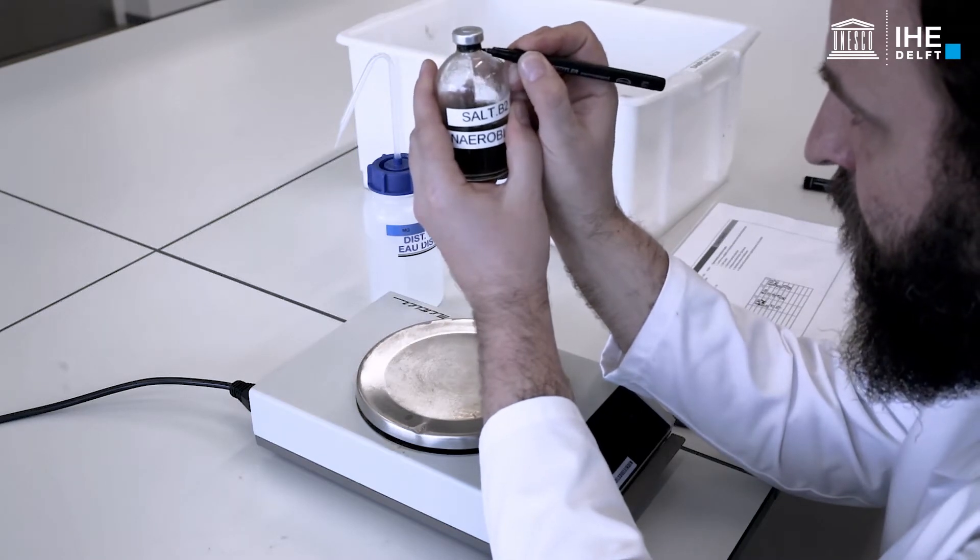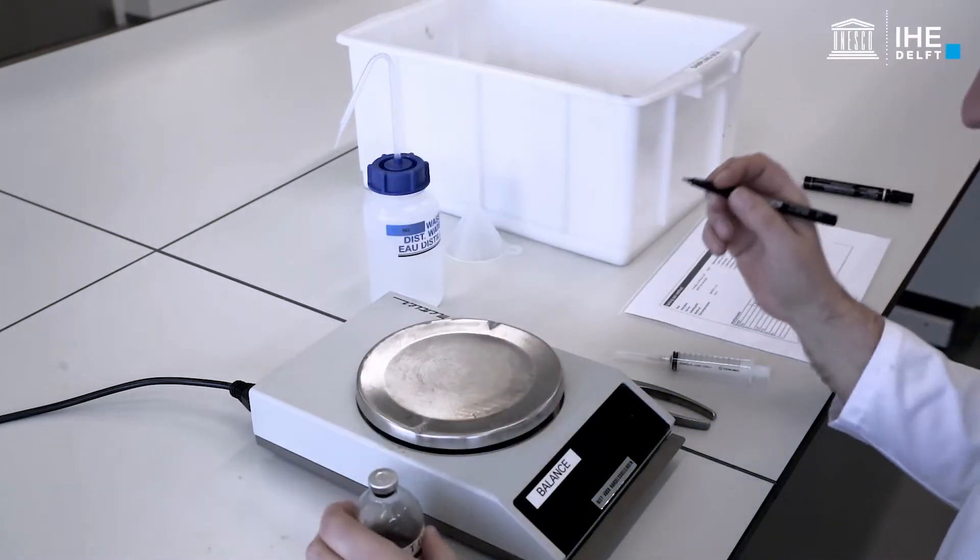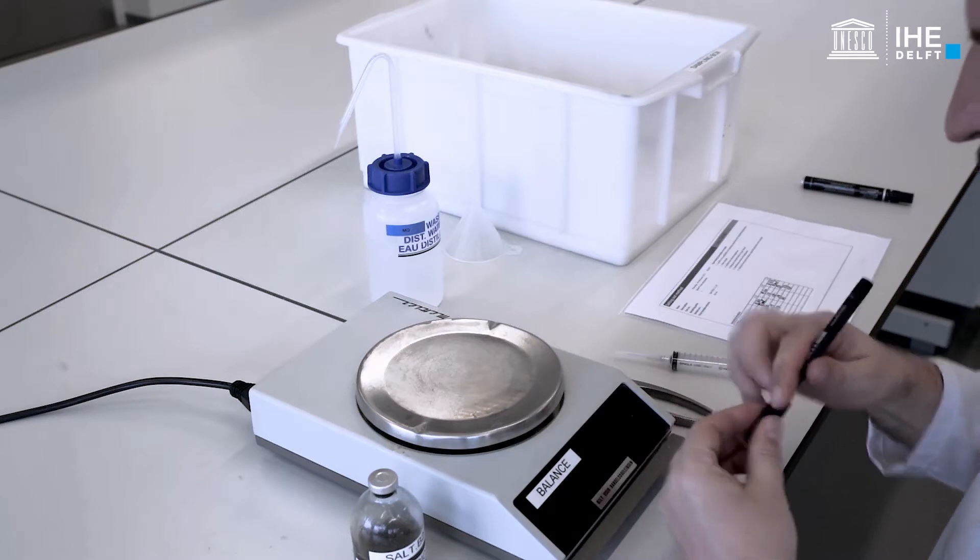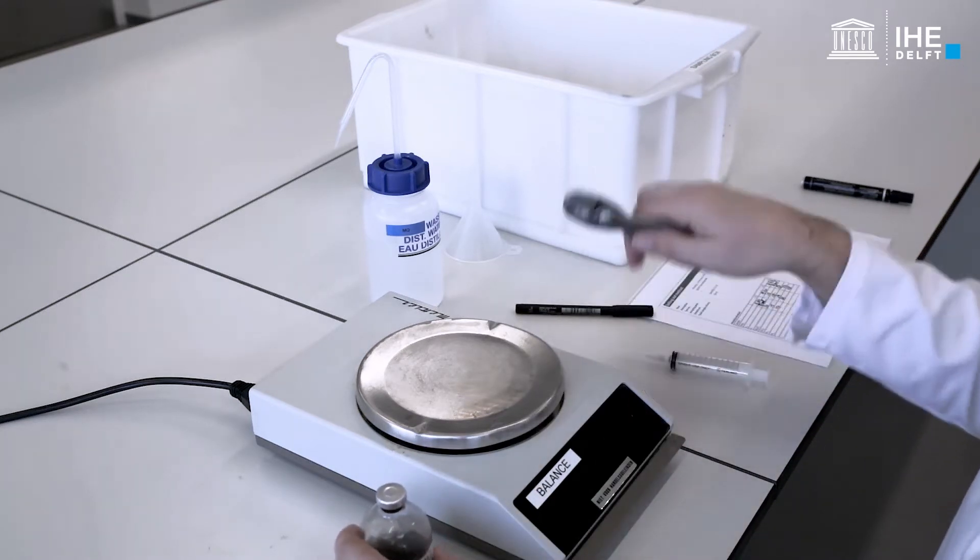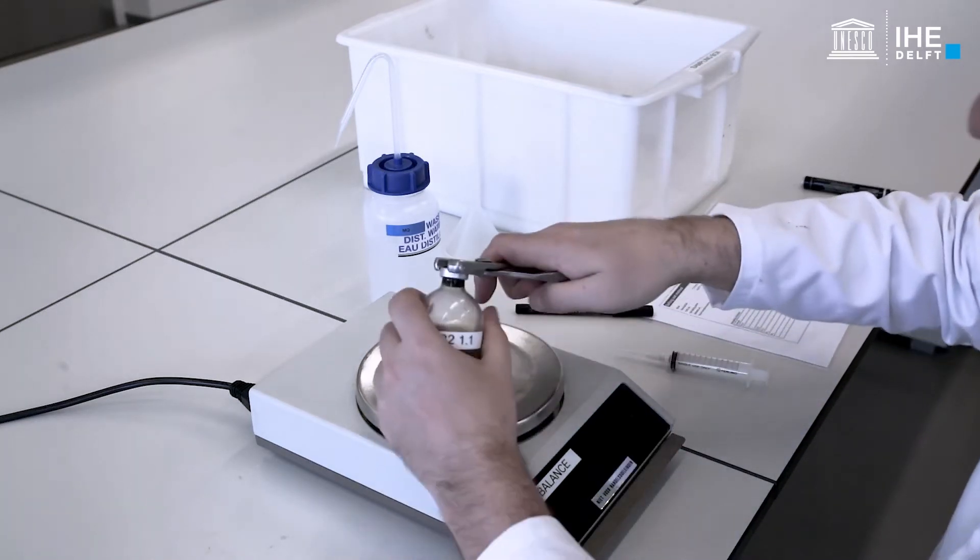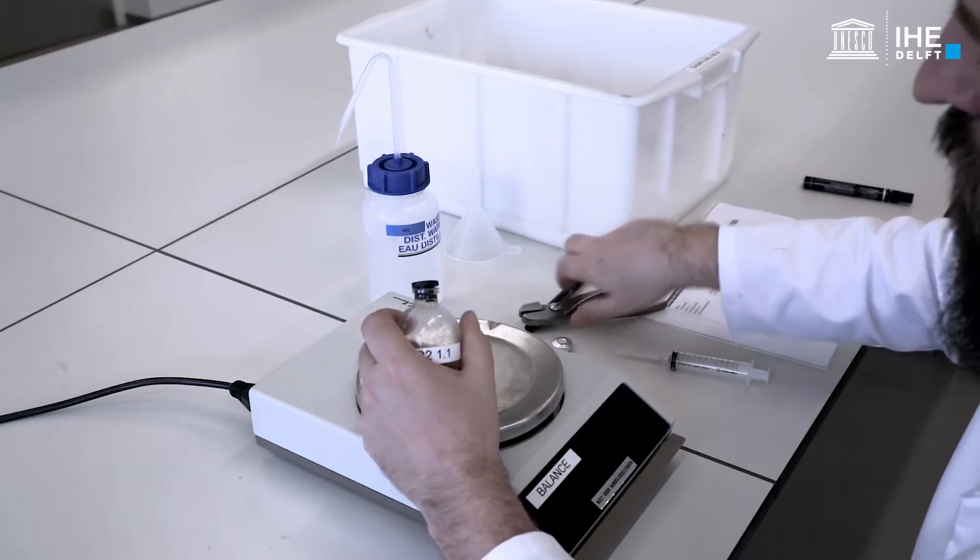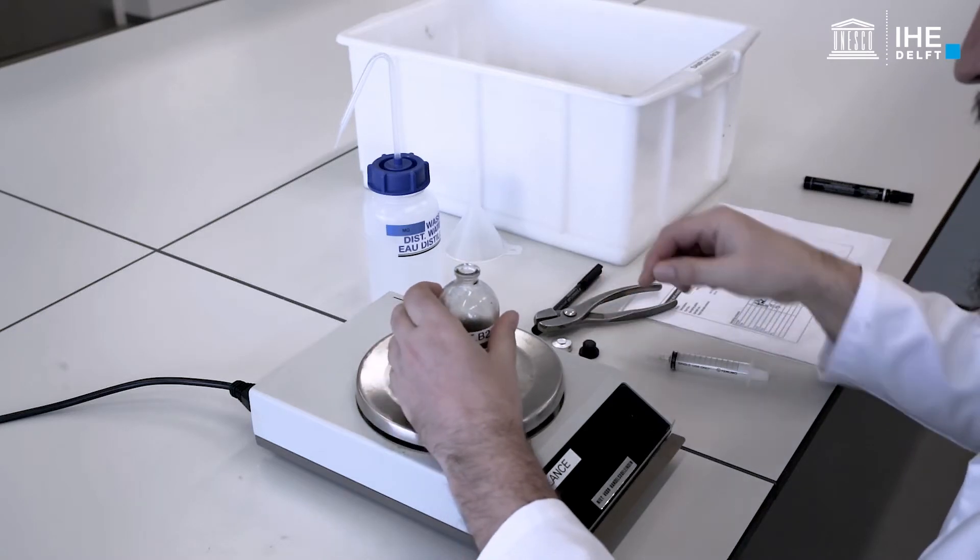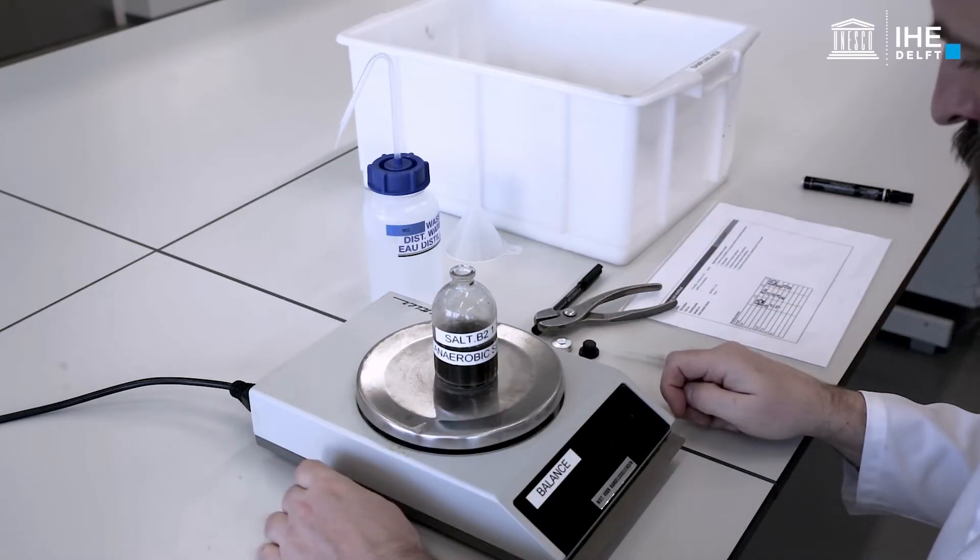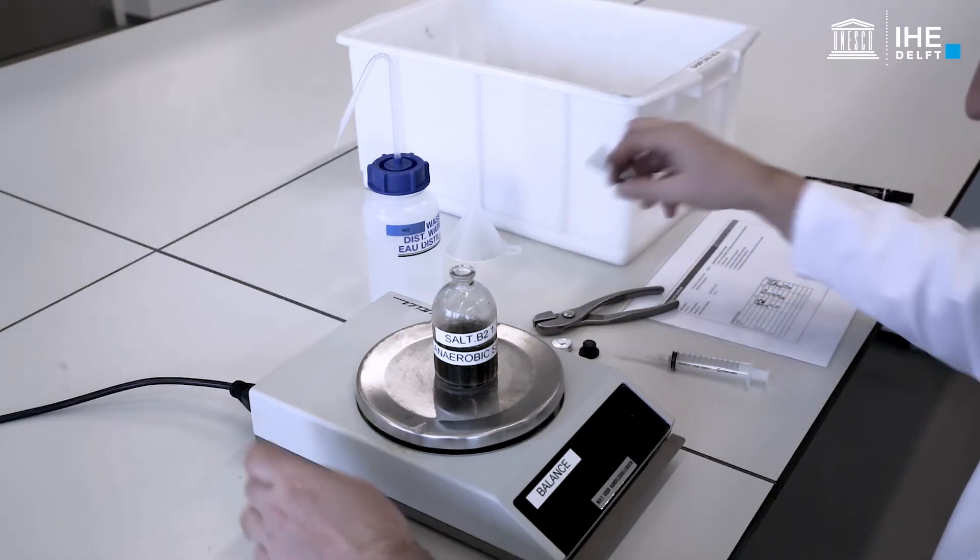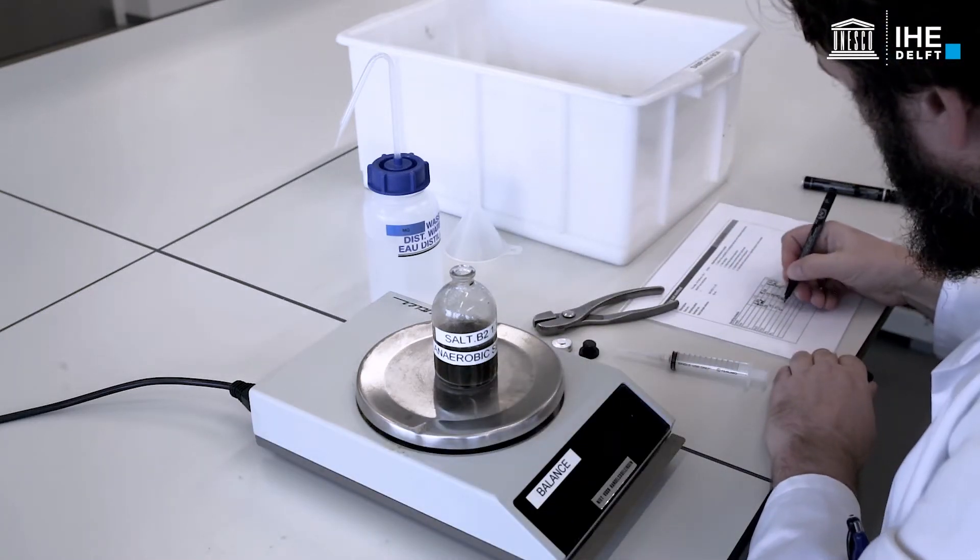Finally, the volume of the headspace of the serum bottle needs to be determined. For this purpose, the water level of the salt saturated sample and the lowest level occupied by the rubber stopper are marked. The weight of the bottle is registered as weight zero.